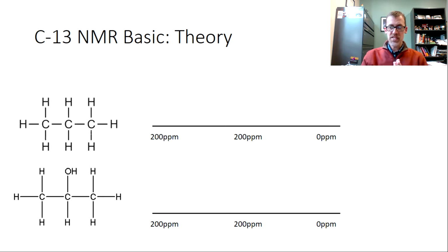Alright, so here's what's happening in the instrument when we put our sample inside. There's two big players, but the most important factor is there's a large magnet. Your nuclei, particularly ones that have these odd numbers of neutrons or protons, are spinning, and they have an electromagnetic field. All charged particles that are rotating have their own electromagnetic fields, and they do affect each other. I don't want to say it's completely random, but if you could somehow look at all your nuclei, they're basically all going to be spinning in opposite directions. They're influencing each other, but it's going to be kind of a jumbled mess.